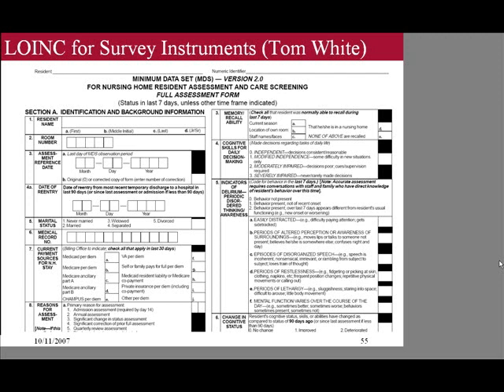And so these are a special kind of thing within LOINC. You basically recreate each of the data elements, and each item, each data element that can be entered into this form becomes a unique LOINC code, and if it's something that has a particular answer list associated with it, it also has a computable answer list that's associated with that question. And Clem might show some of this when he gets in and does RELMA.